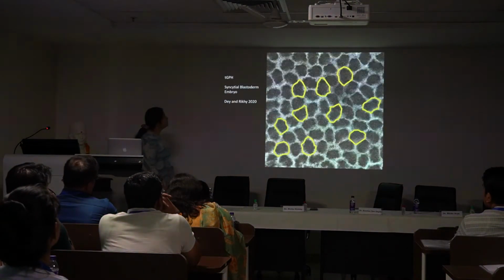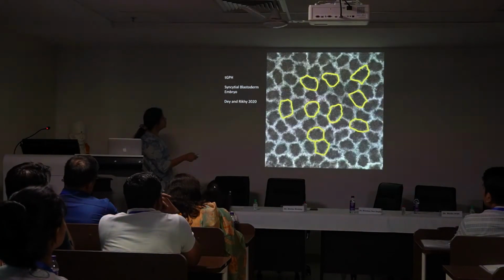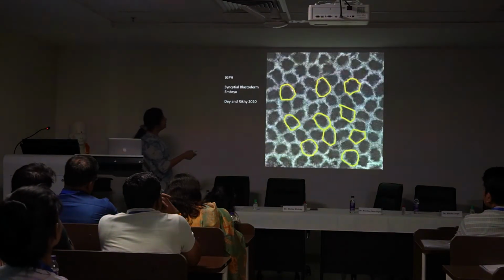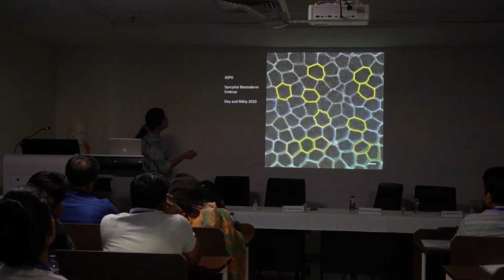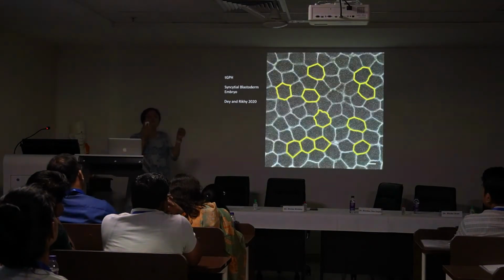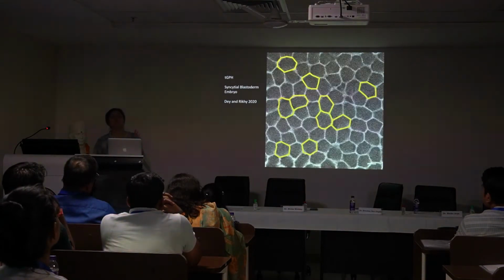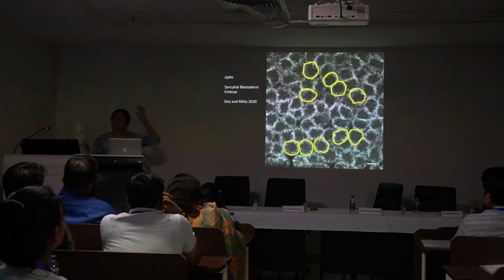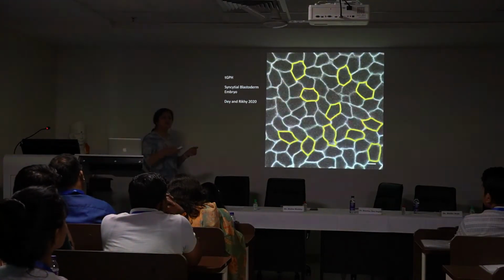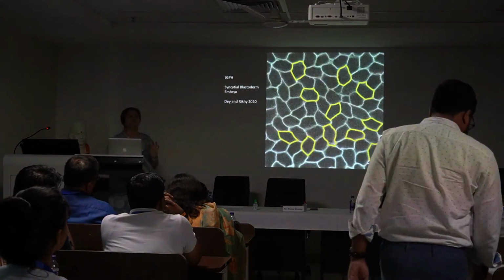When you look at each syncytial division cycle, you can see that there is a stereotypic shape change from circular organization of cells to polygonal organization of cells. And what you see here, when the cell is a circle, you see more ruffled presence of the membrane. Right, so it's ruffled. That's all you can make out with a confocal microscope. So watch the point at which it is a circle. You can see that the membrane is ruffled. Most likely that ruffling is actually coming about because of the presence of villi.